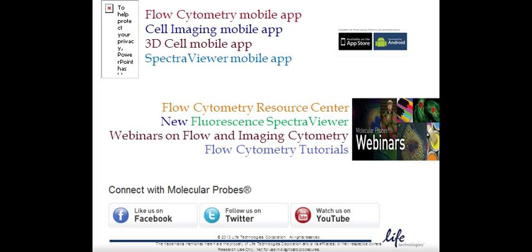So I have a question about what I should do first for optimization. I can say that with initial experiments, you can try a range of dye concentrations to determine one that gives you your best or optimal staining. This would be for a given cell type, buffer, whatever your experimental conditions are. And it's really important to remember that within the same experiment you have the same number of cells with each sample in your test and the same concentration of dye.